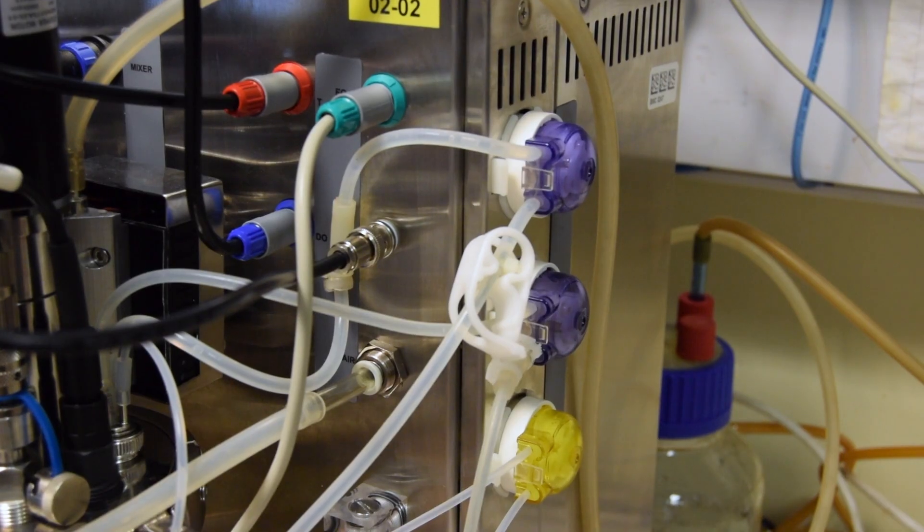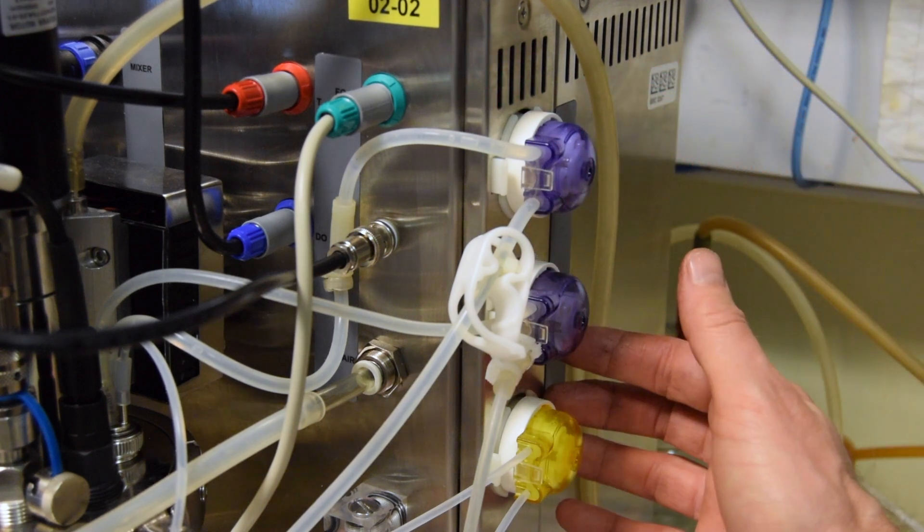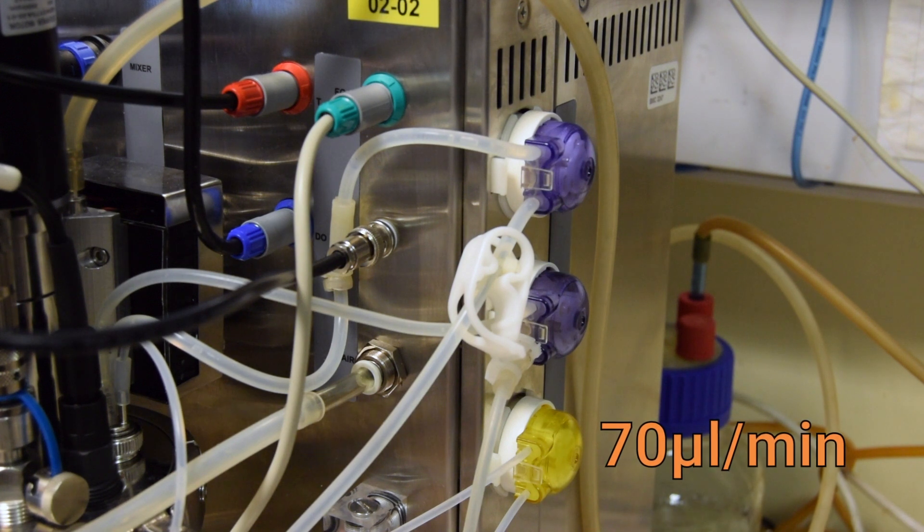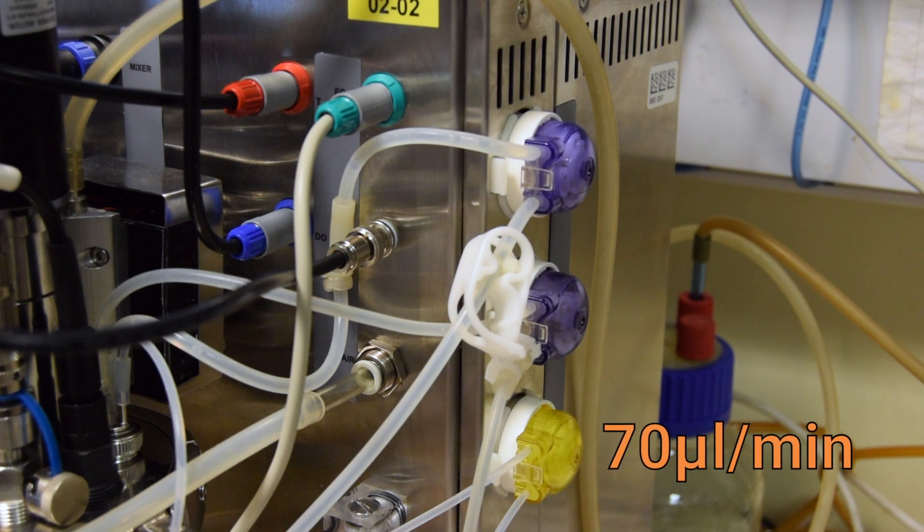These are variable speed controlled peristaltic pumps. For example, this is the feeding pump. The minimal flow rate of this pump is 70 µL per minute.